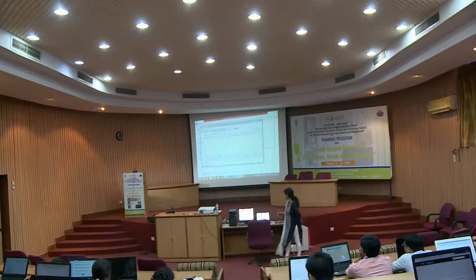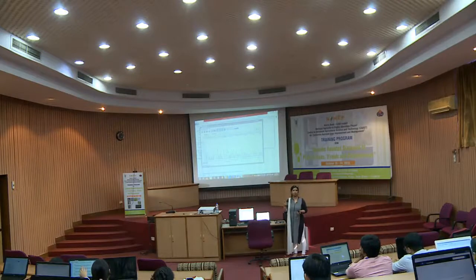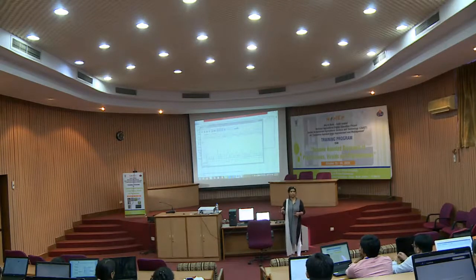correct. So I will be provided with 2 types of sequence, one from the forward and another from the reverse, right. There are many other formats also which the company will provide, but they are of no use to us. So we just need the chromatogram file and the FASTA file. FASTA file we will consider, but we will go with the chromatogram file first. If there are some errors, we will try to check those errors, and if that is actually the correct base, then we can take it further, right.